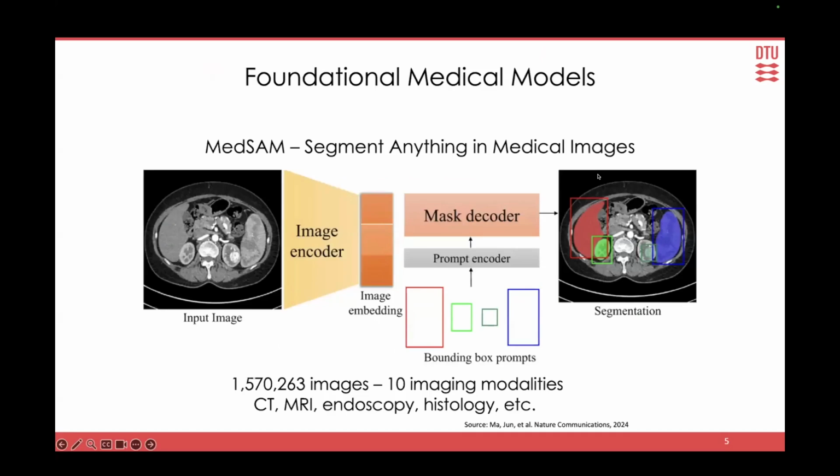Another area is the medical image analysis area, and they're actually working with 3D data. So progress has also been made there based on the advances of the Segment Anything Model, namely, for example, MedSAM, Segment Anything in Medical Images. That's a model trained on 1.5 million images from 10 different modalities.